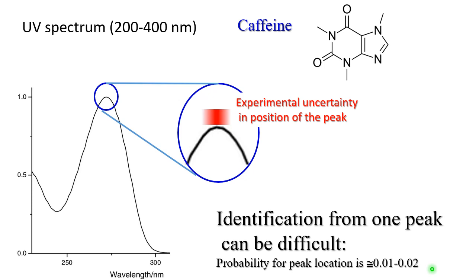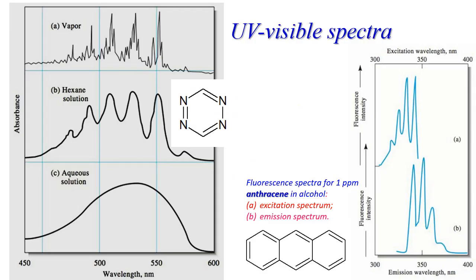So if you have several compounds with different spectra, you can select your caffeine from that. Unfortunately, it's not very straightforward. For example, if you have theobromine, same as caffeine, just without a methyl group, the spectrum will be very similar, so you'll not be able to differentiate it. What can be done? We need more information. One peak is not enough.